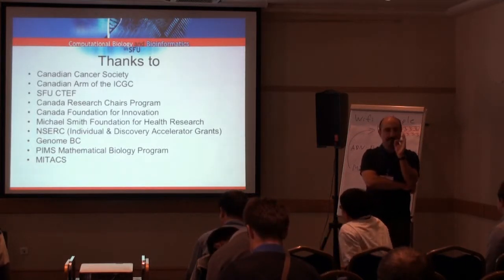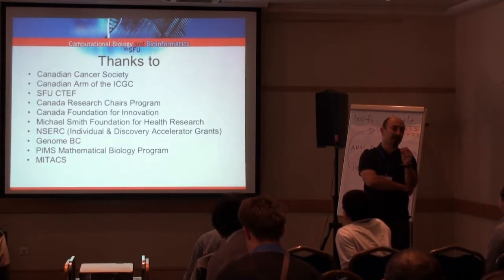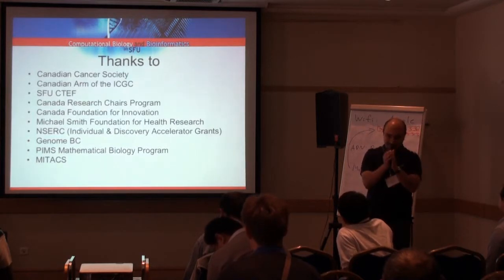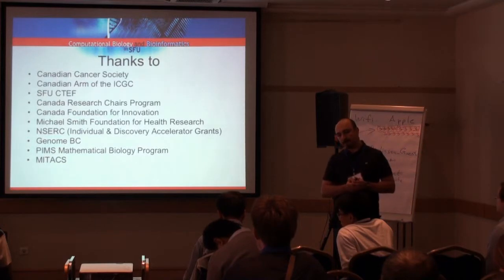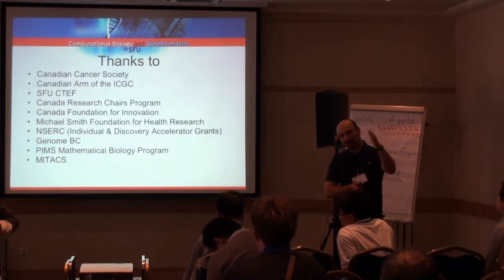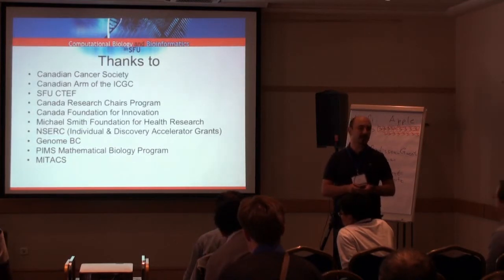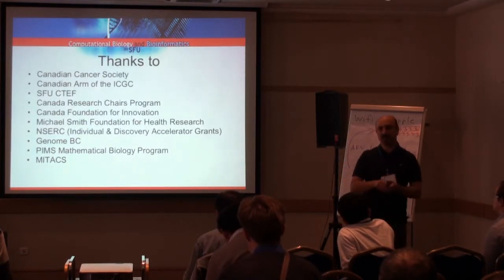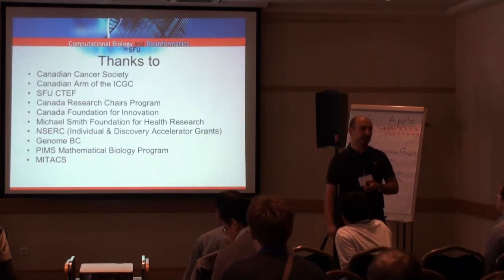One of the key things that we missed was reliance on a single type of signature. It's the mapping and the discordance. However, after we looked at the depth of coverage, we noticed that some of the events that we thought we discovered are just wrong, because a novel ALU insertion was followed by, say, an inversion.